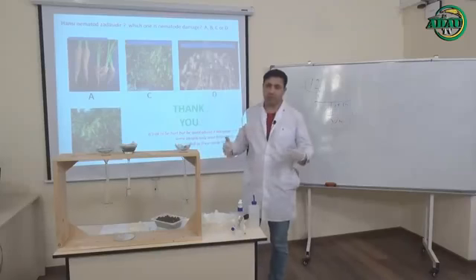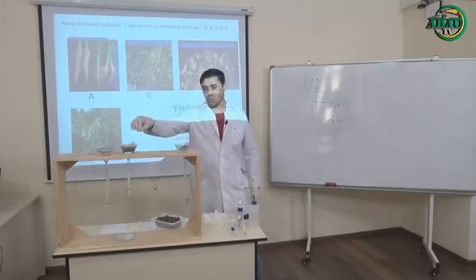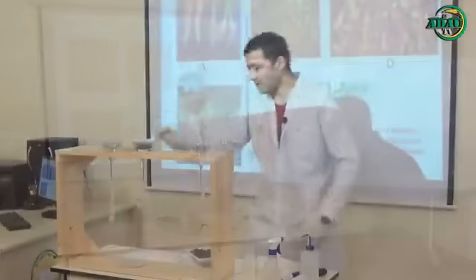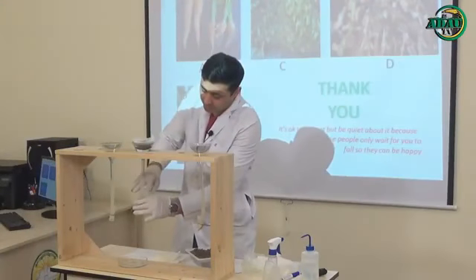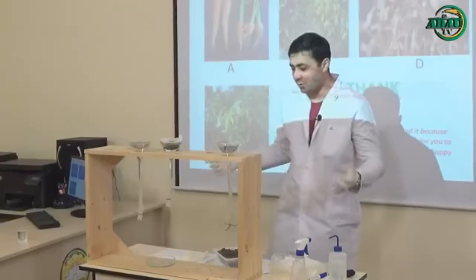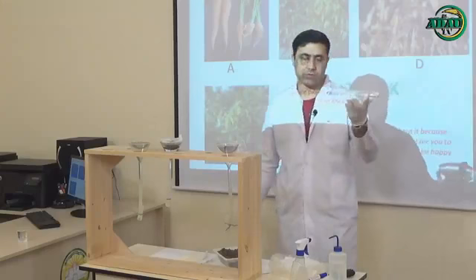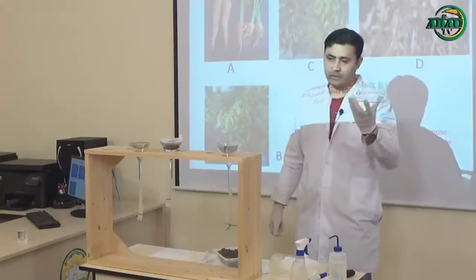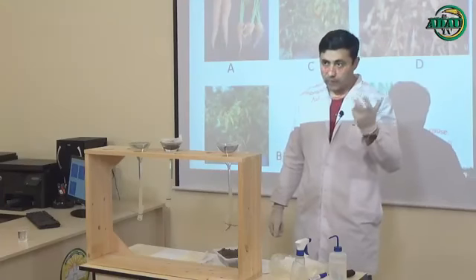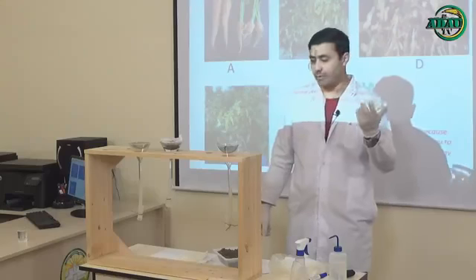But what will happen after the 12 hours? After 12 hours, all the nematodes will come to the downside of the water. Then we have to come to our laboratory and take one glass. We also call this the Petri dish, and you can use any dish. It's not a problem, but it must be clean. You have to be sure your glass or your dish is clean.